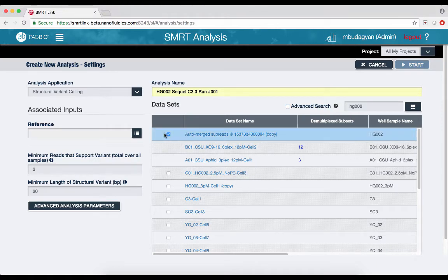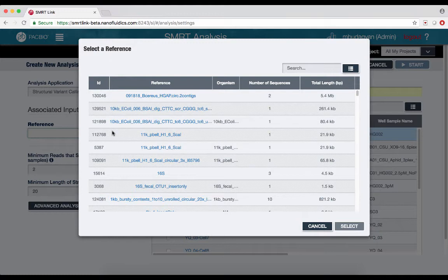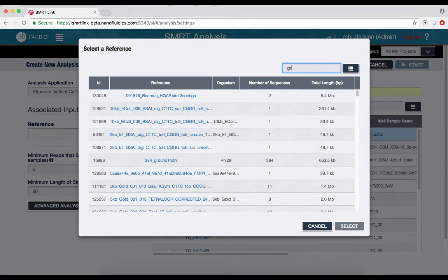Select a reference. I'll select the GRCh38 human reference.